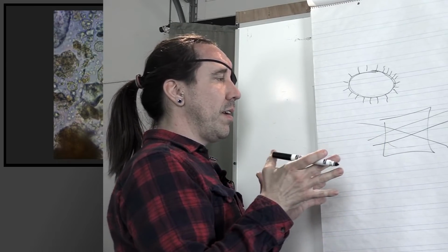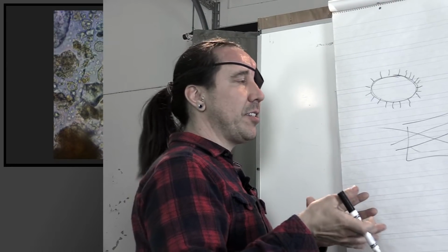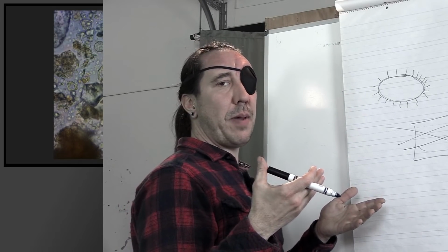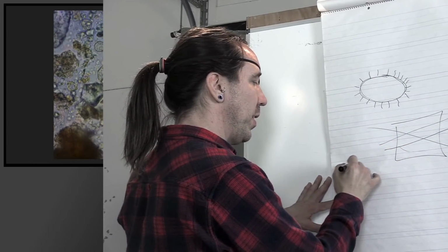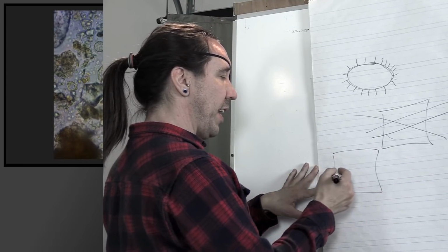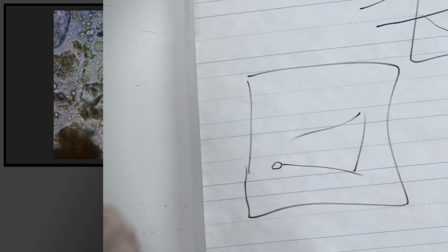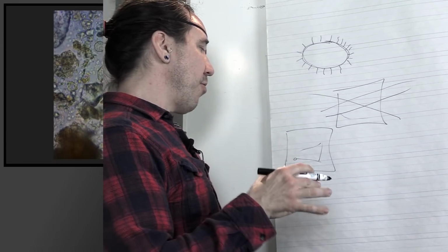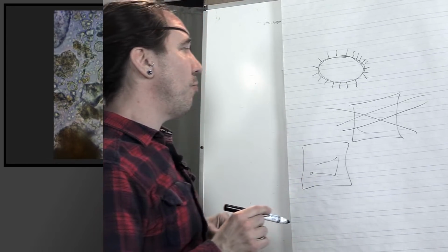We'll go through the magnifications in a few minutes, but we're generally looking at everything at 400 times magnification. So if you see something zoom across, you'd want to flip back to 100 times or 40 times magnification so you can see more of your slide. Then when you zoom out to less magnification, you'll see this thing zooming here, zooming there. Just a few of those are fine. If you've got more than 2 or 3 in a sample, then you're most likely having anaerobic conditions in your compost pile or soils. Those are things that we are not wanting to see.